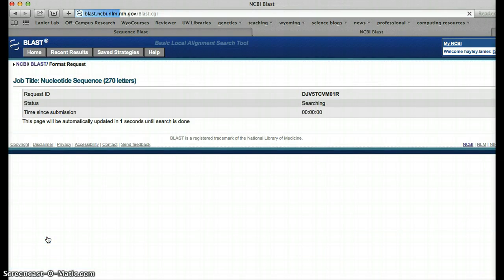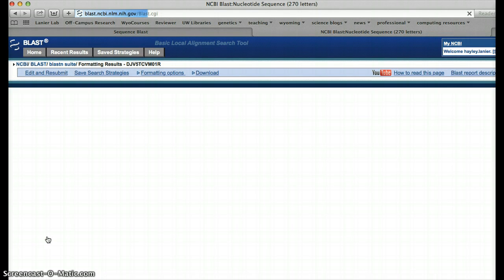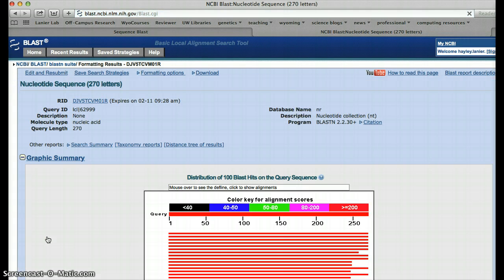So we hit blast, hit queries the database with literally millions of sequence data, and it comes back to us with a summary of our results.